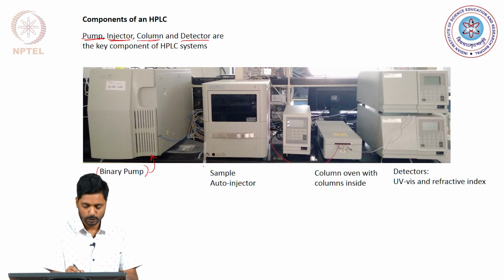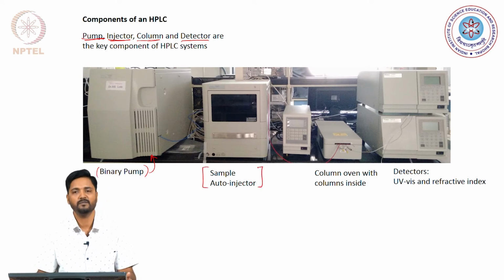Because of the throughput of the samples, we have used an auto injector to automatically inject the samples into the chromatography system.